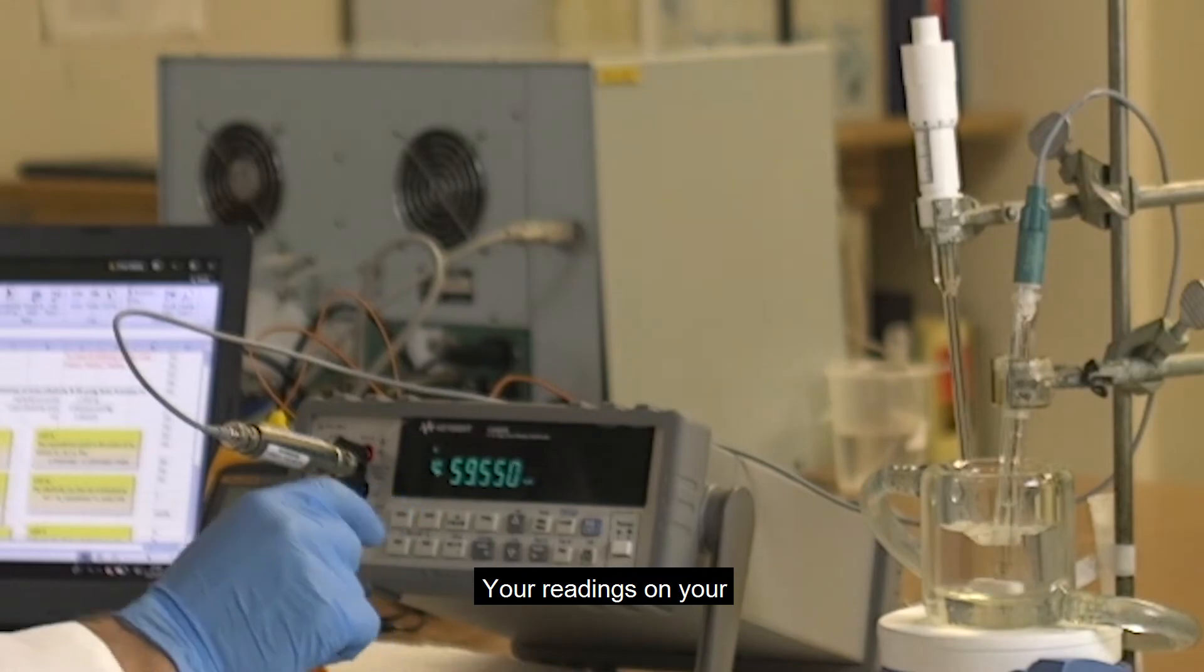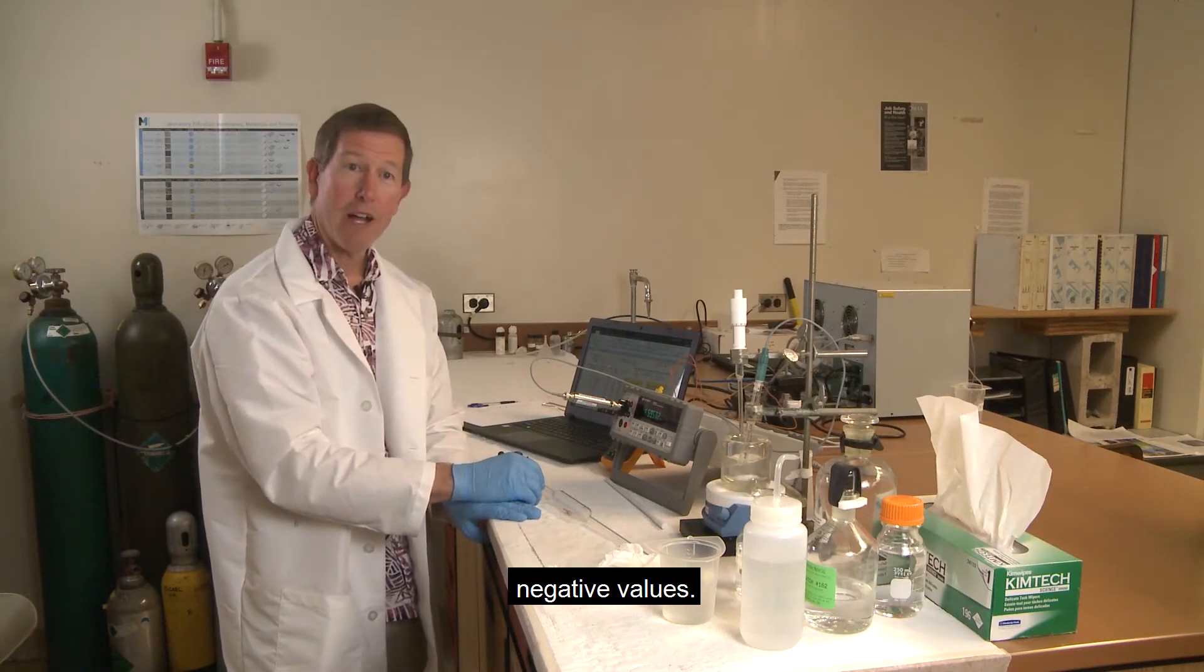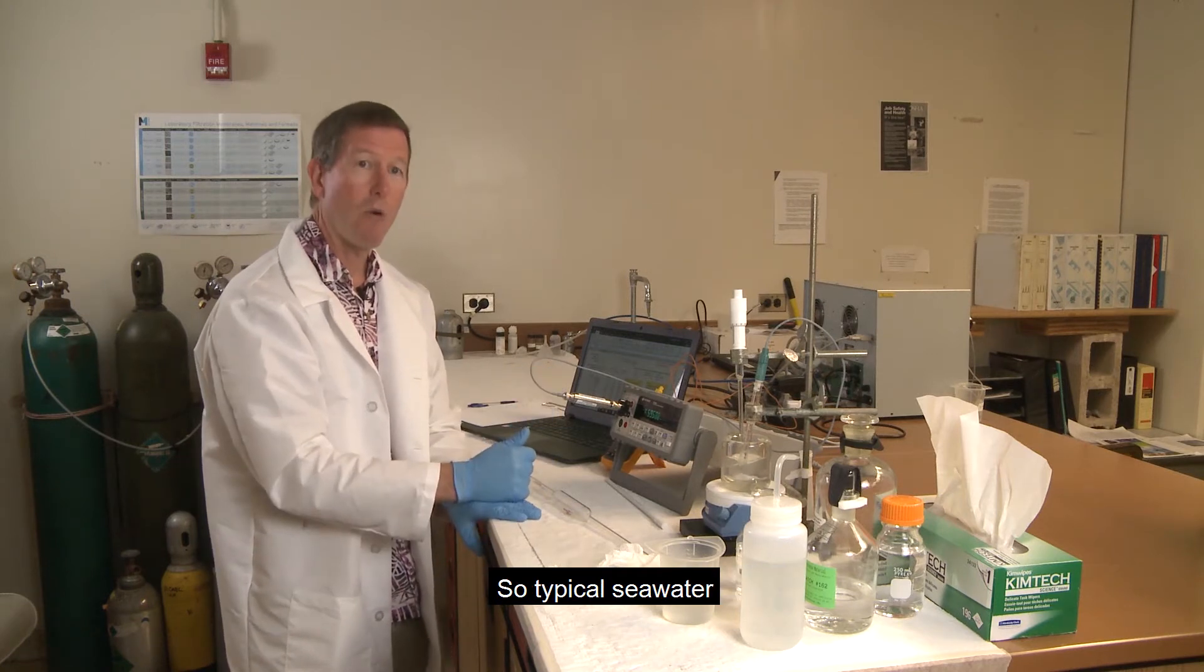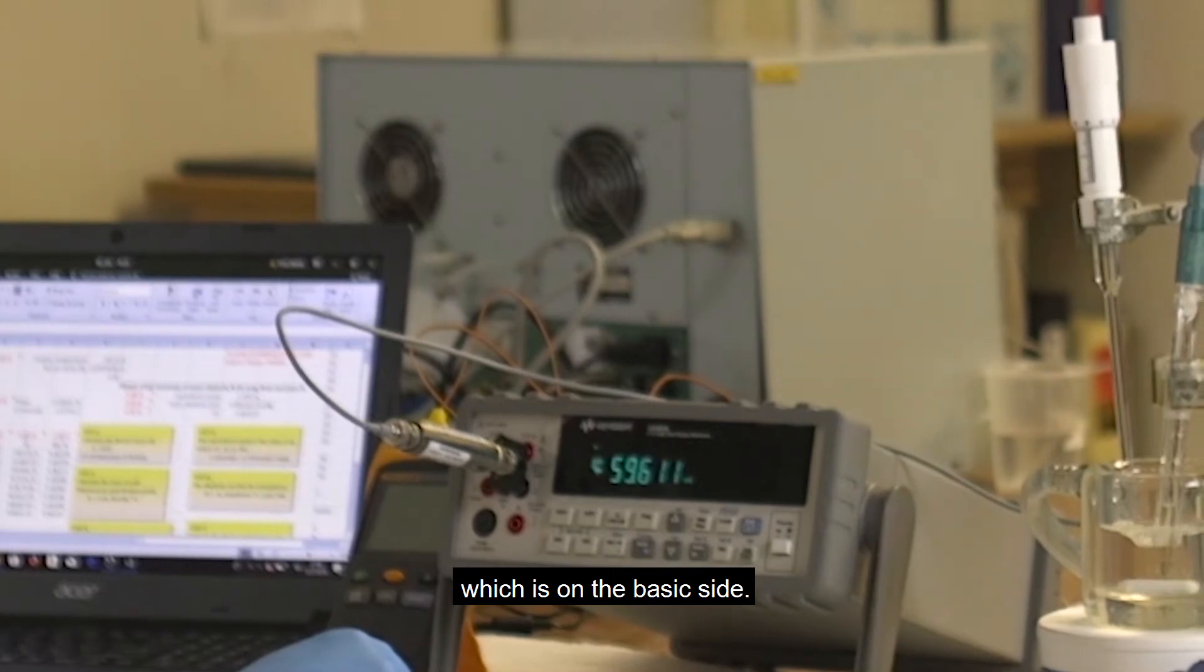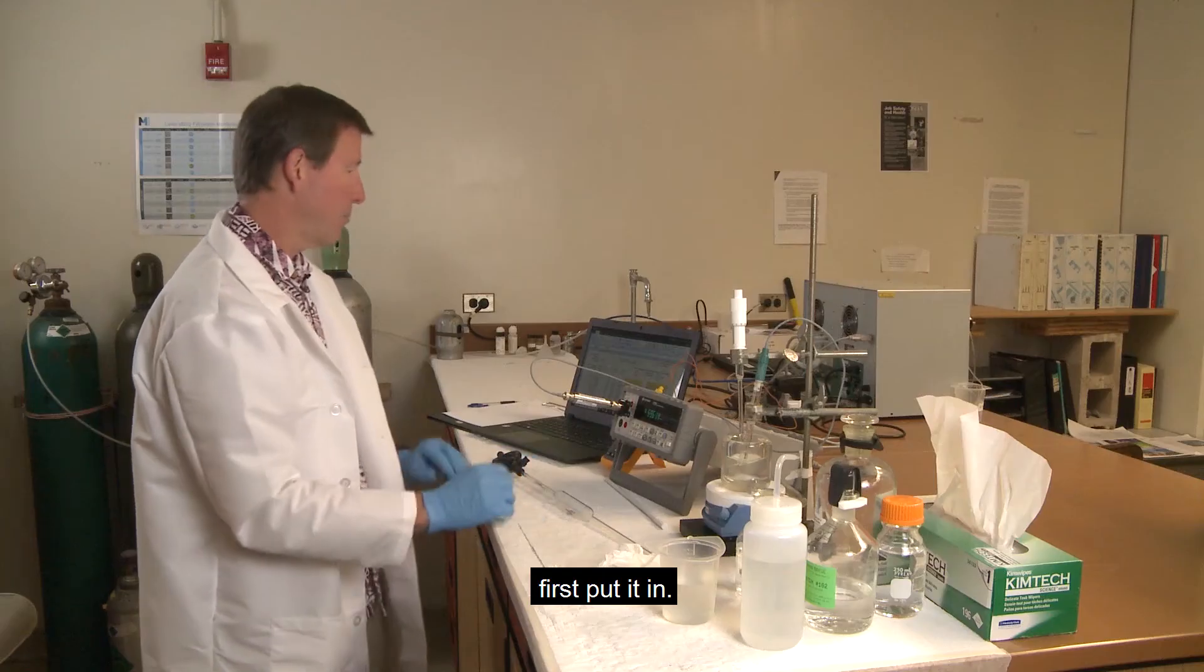Your readings on your voltmeter should be in the negative values. That means it's a basic solution, so typical seawater is a pH of around eights, which is on the basic side. So you should be getting negative readings when you first put it in.